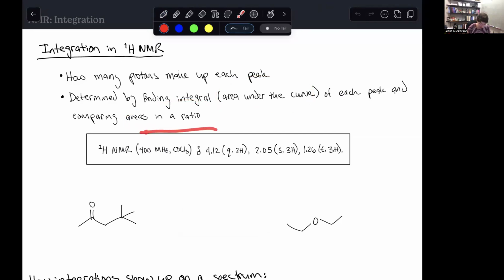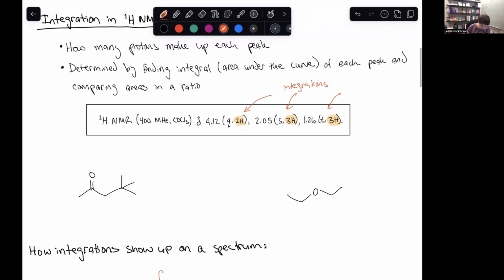Okay. So if we're looking at our summary NMR that we've been pulling out for the last couple of videos, the integration number is found right here. Okay. So integration. It's a super handy piece of information because it tells us how many protons are in that unique environment, which is really, really helpful information to have. So if we look at a couple of examples here, this very much comes down to being able to identify your equivalent proton environments, because that's going to depend on how many protons are in that environment, okay? Which is what our integration is telling us.